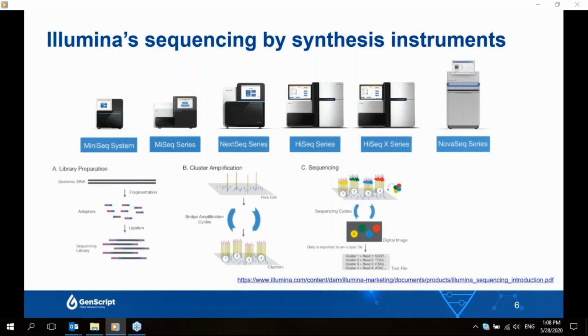Next is the sequencing step. The copied DNA on the flow cell serves as the template for Sanger-like reaction to happen, and DNA sequences are read from each spot on the flow cell. Last is to transform the reading from the machine to nucleotide information and start to perform scientific analysis.